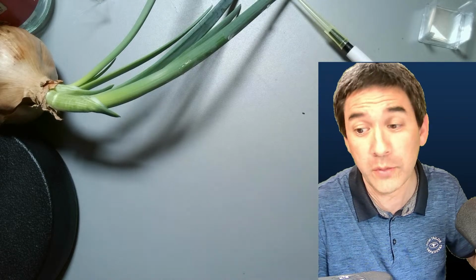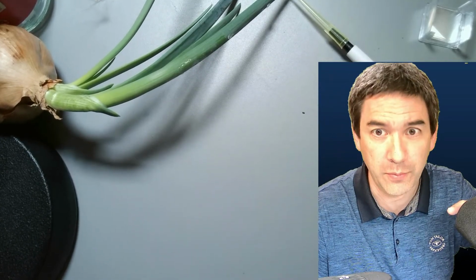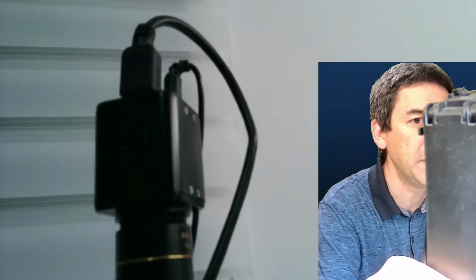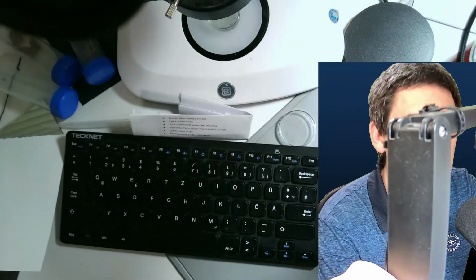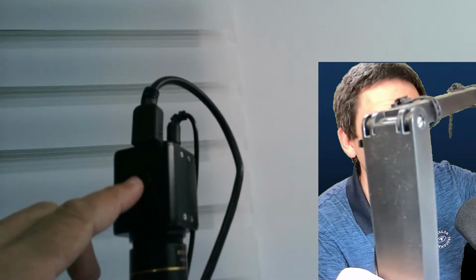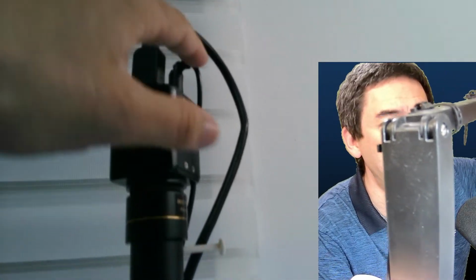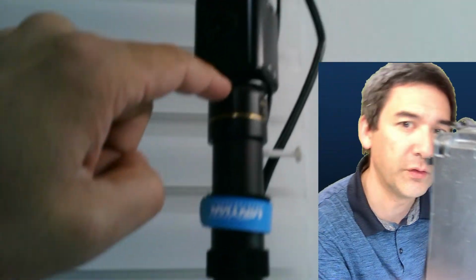I'm going to show you my other camera setup, the one that I've got on my stereo microscope. Okay, so I have to lift this up carefully. And this here is my stereo microscope. You see my messy table. What I have here is an industrial camera, HDMI power supply, and this here is a C-mount.